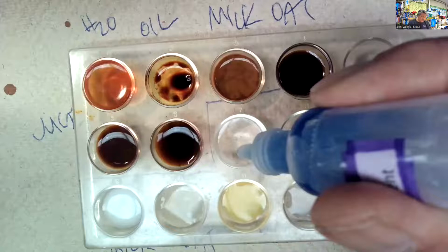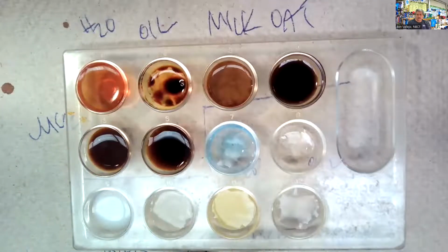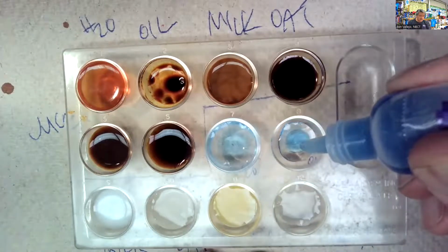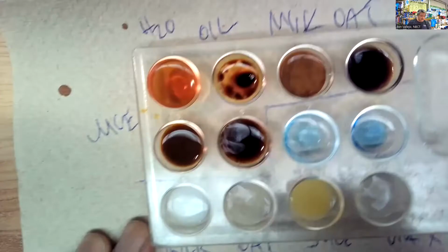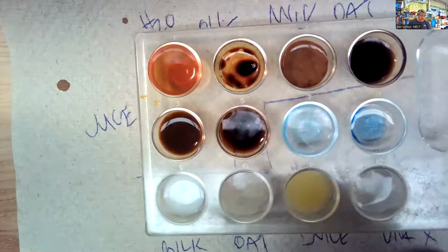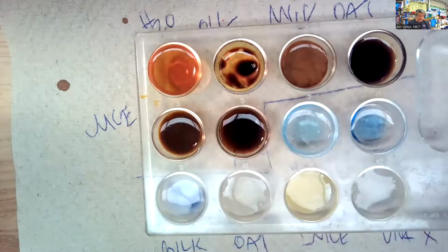First, the water. 1, 2, 3, 4, 5. Remember, we're looking for a purple color. There's oil. 1, 2, 3, 4, 5. Okay, pretty blue so far. Is there protein in milk? So check that out. 1, 2, 3, 4, 5.